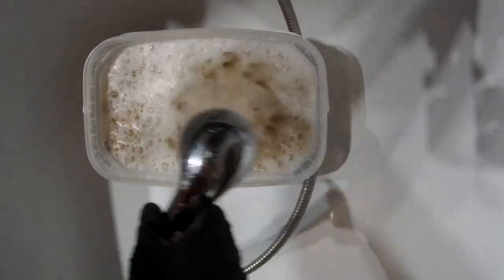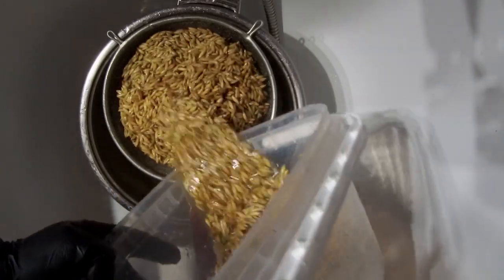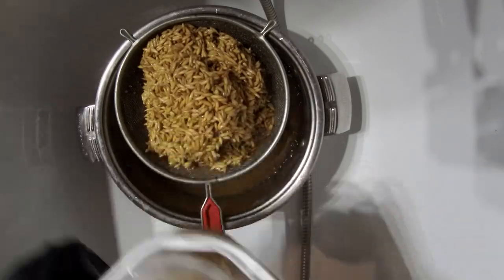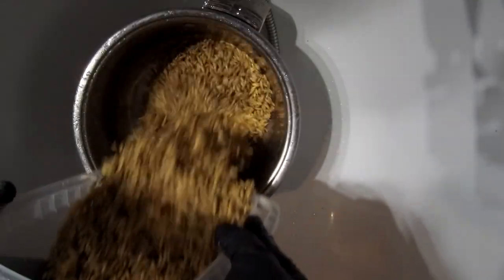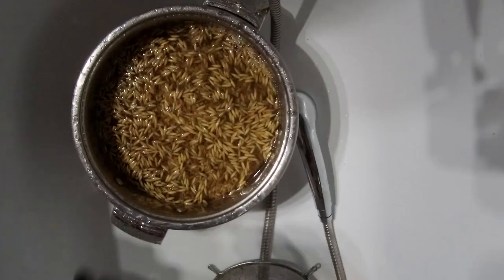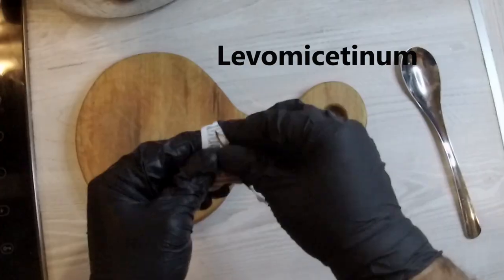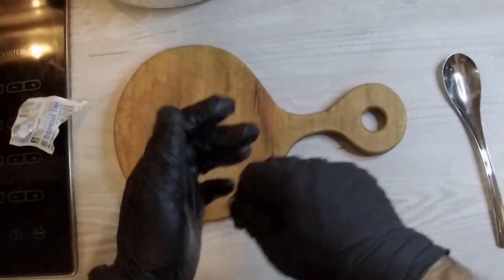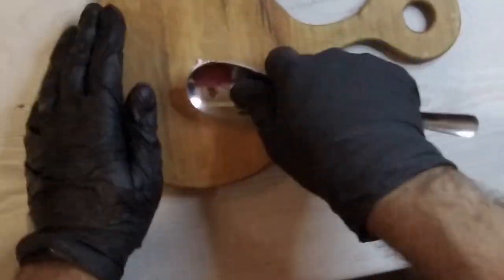After 24 hours all bacteria in the grain have become active — this is what we need. We will wash the grain with tap water several times. Add half a tablet of the protective agent for each kilogram of grain. It will partially protect us from spoilage.